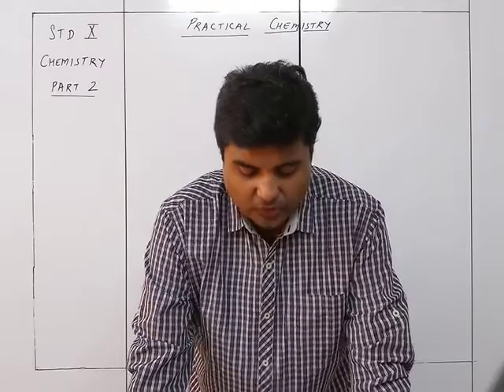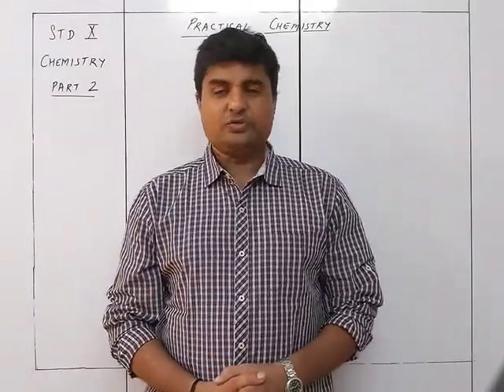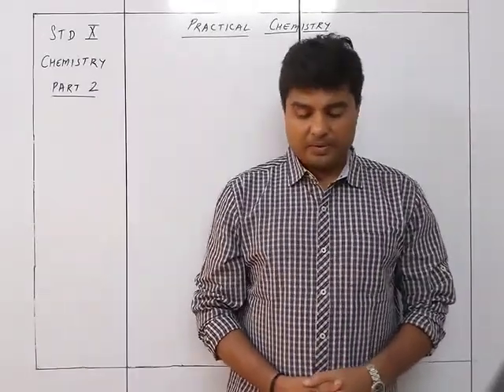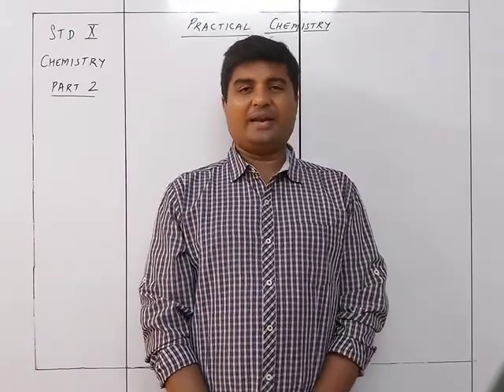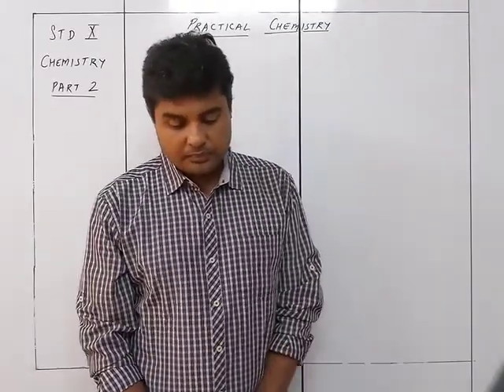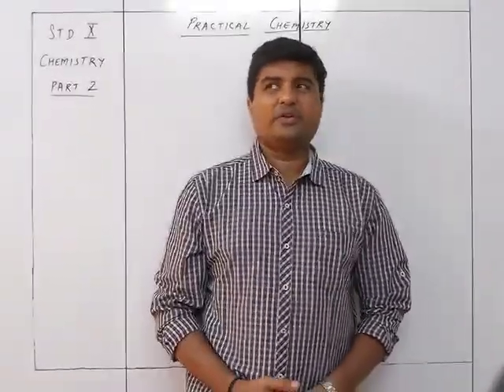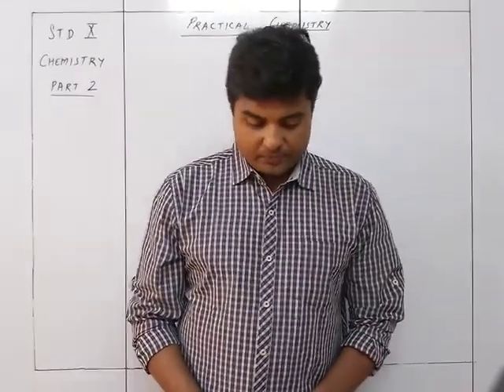The gas evolved is water vapor initially, but afterwards it will be NO2 plus O2. Nitrogen dioxide is reddish brown, acidic to litmus and turns moist KI paper brown, and oxygen is colorless, neutral and rekindles the glowing splinter. The residue formed will be black copper oxide.